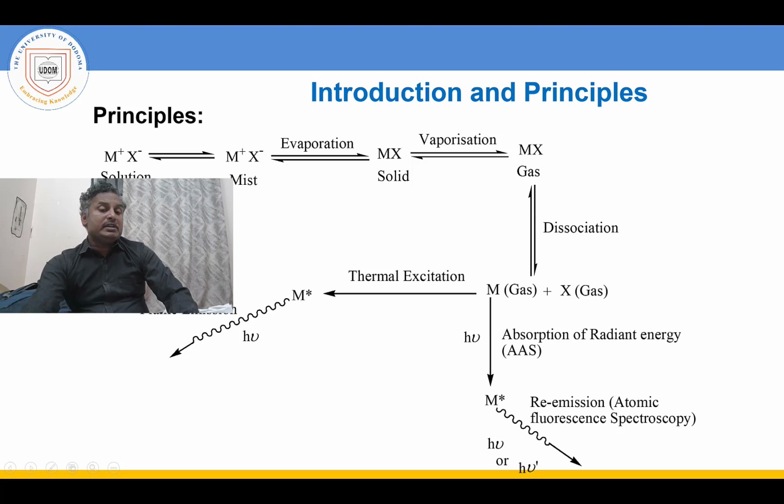So you are introducing a solution to the instrument, that may be atomic absorption, atomic emission, or atomic fluorescence. These three work with very similar principles. I am going to explain the differences to you by using the same slide. Now, the solution will be changed to mist.